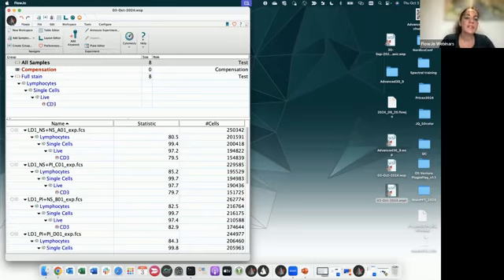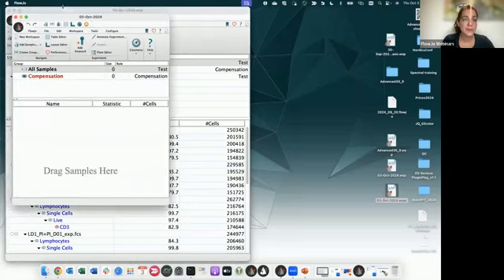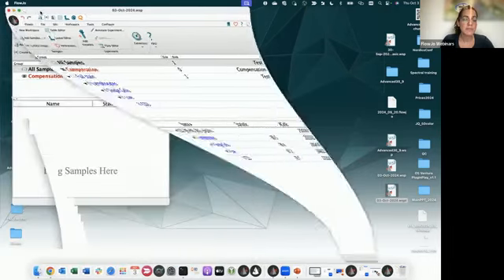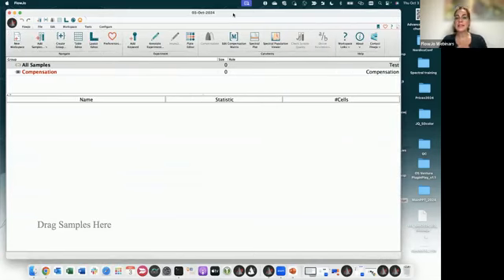So now the question is, if I have two variables, do I need to do two concatenations? First concatenate my donors and then concatenate my treatments? No. The short answer to that is no. You need to do only one concatenation step. And what you want to do before concatenating is assigning keywords to your data.